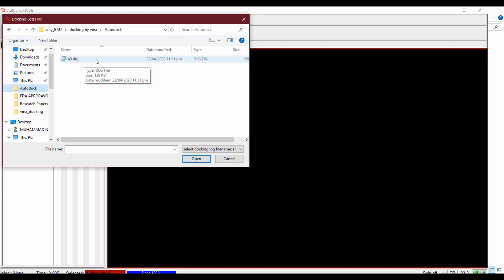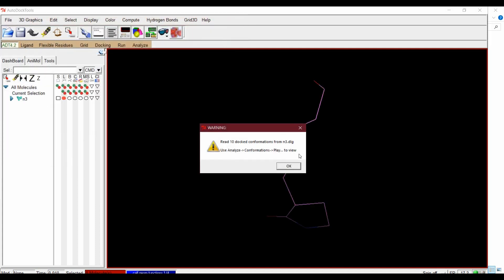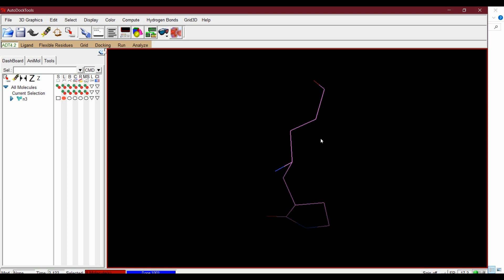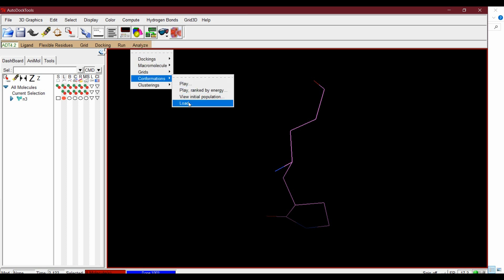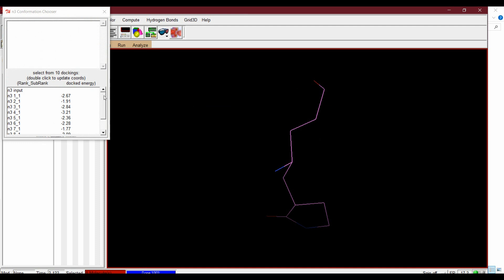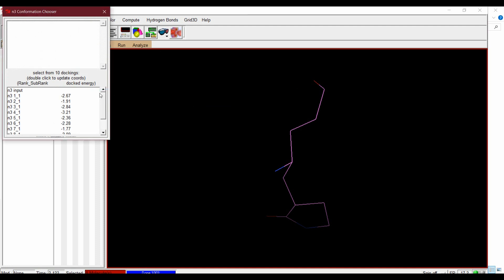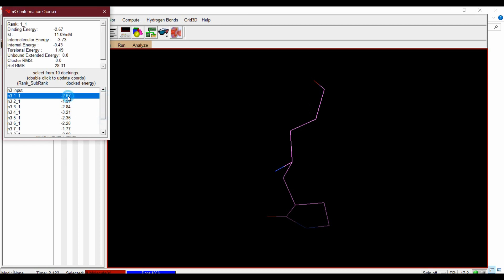This will load our ligands. From Analyze > Conformations > Load, you will have their binding energies for all these modes. If you click on a mode, this gives a detailed explanation of the energies associated with that ligand.